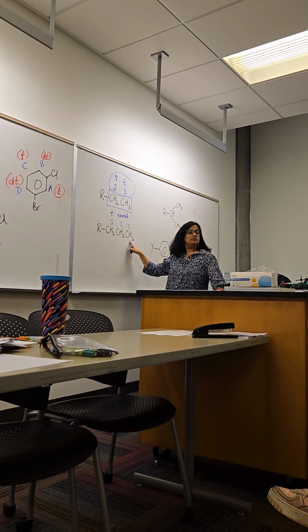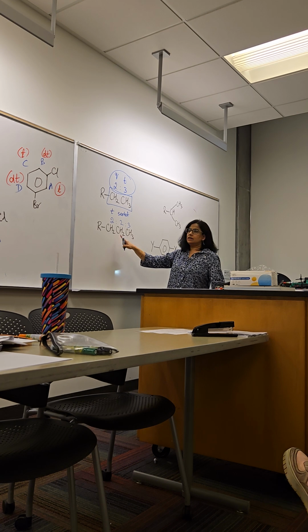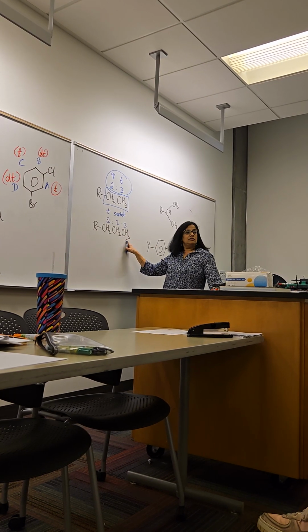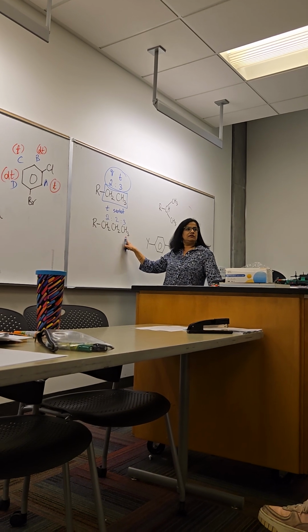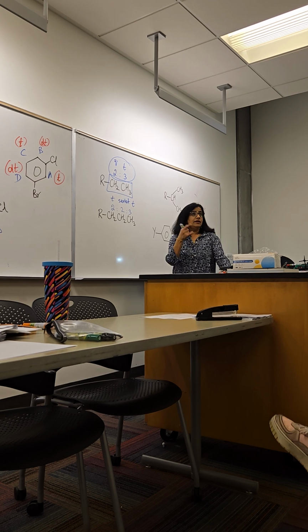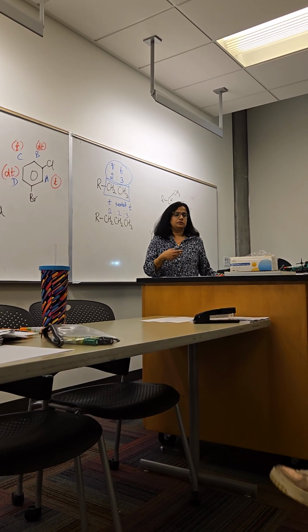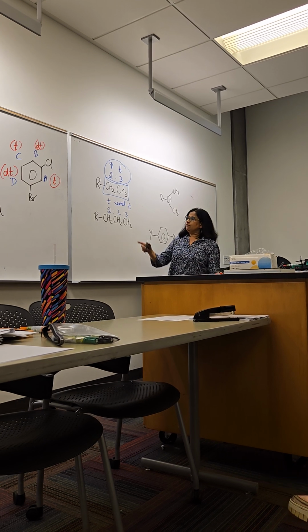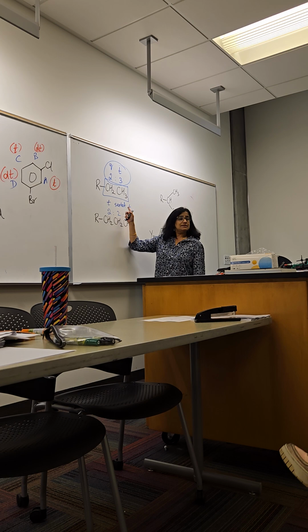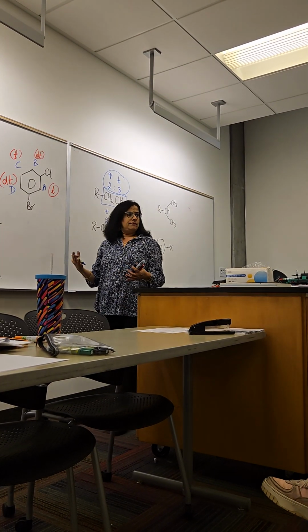And what would that be? It has only 2 neighboring hydrogens. That's too far away. Doublet. Three sigma bonds only, please. Let's take a look carefully. Oh, triplet. So these are the patterns you might notice in those spectra which make the process easier. If you see 3 signals in a 2 to 2 to 3 ratio with a triplet, a sextet, and a triplet, oh, is there a propyl group somewhere?